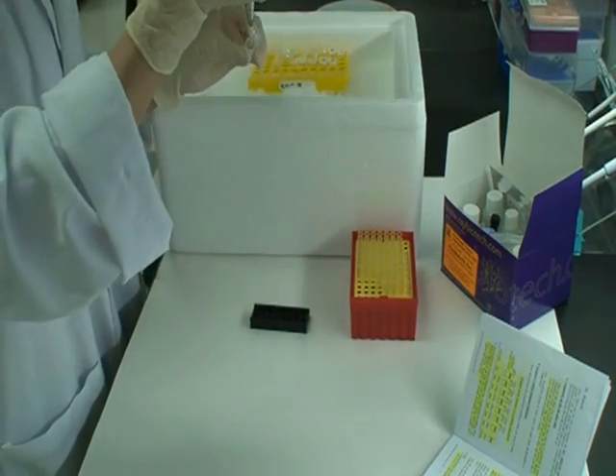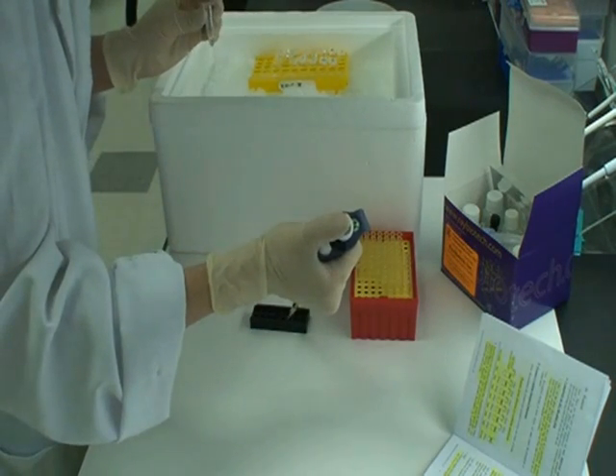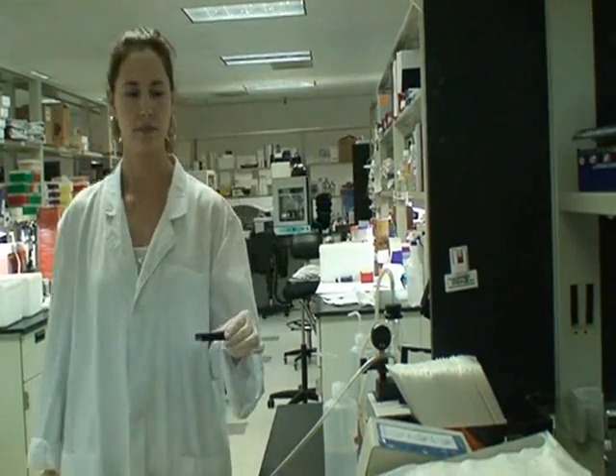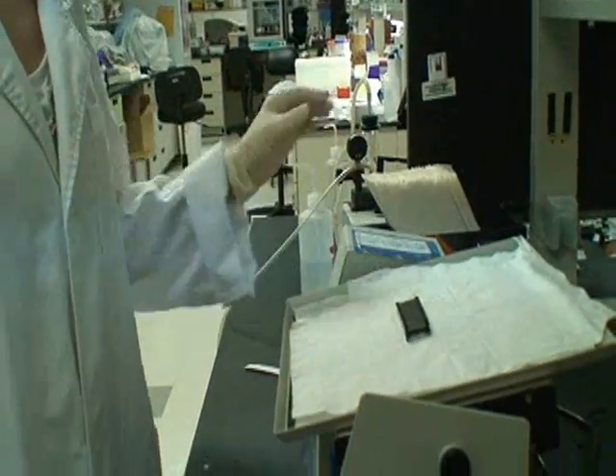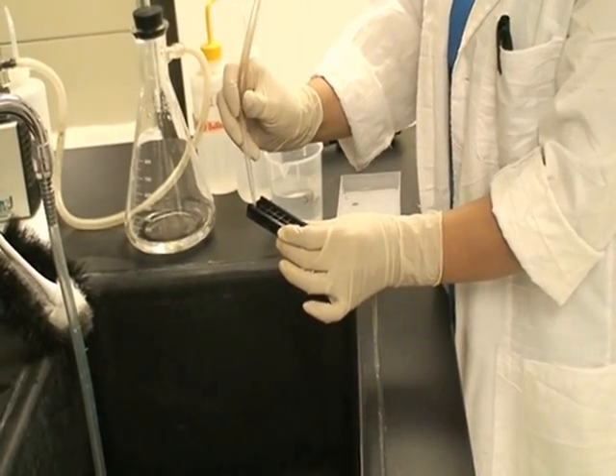After blocking is complete, decant the sample diluent buffer from each well. Then add 100 microliters of cytokine standards or samples and incubate for 1 to 2 hours. After incubation, decant the samples and standards from each well.